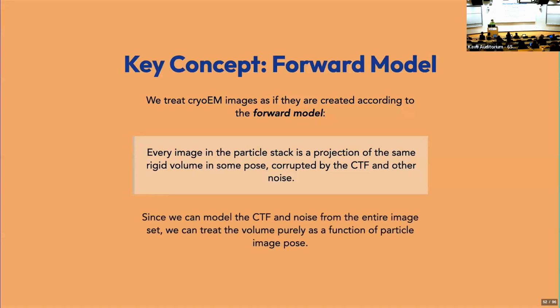The nice thing about this is that since we can get the CTF, we can model the CTF from micrographs, right? We don't need to know anything about individual particles to get the CTF, like Ollie was saying. And the noise is kind of right there. It's a little more complicated than that, but for all intents and purposes, we can model the noise directly from the micrographs as well. We can treat the volume as purely a function of the particle image pose, okay? So once you have the poses, you have your volume. It's really, really nice. And it's also why I've been really emphasizing thinking about poses.